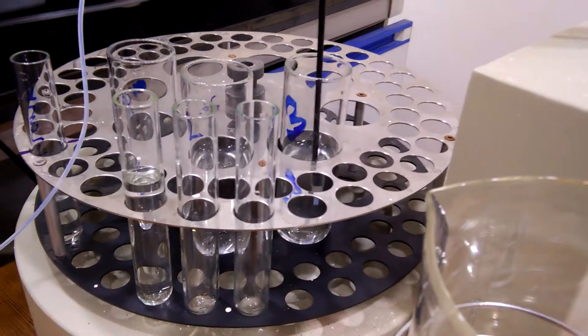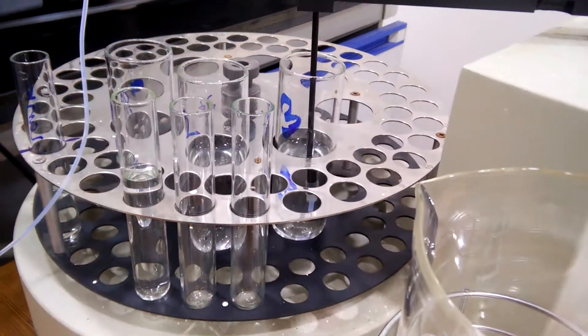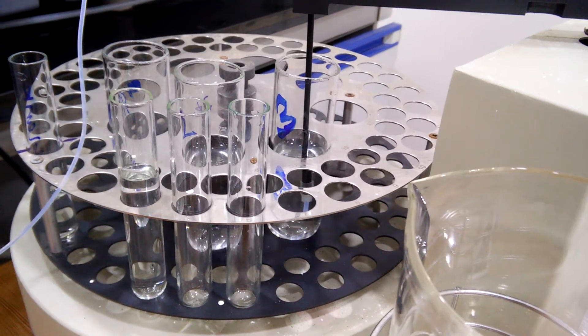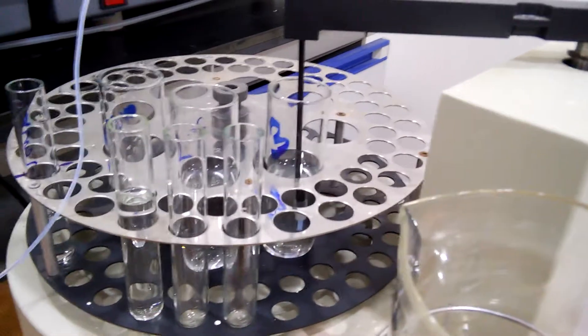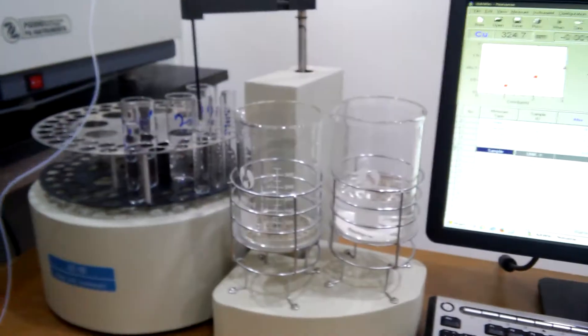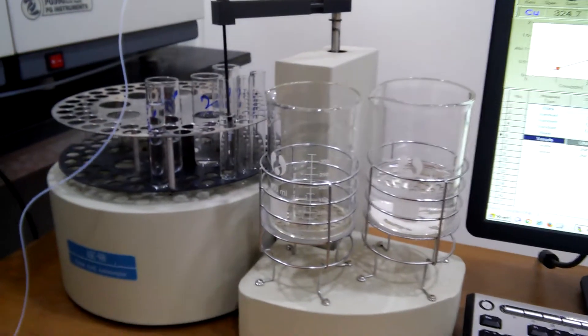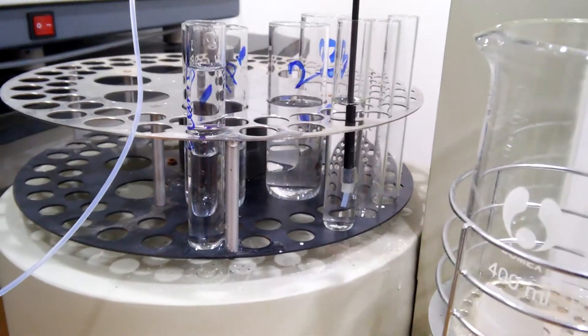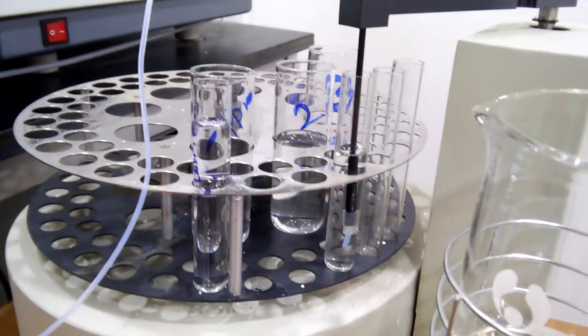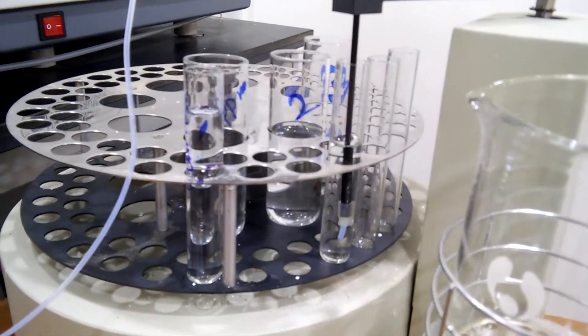Now it's getting the third standard. Now it's getting the first unknown which is in position four.